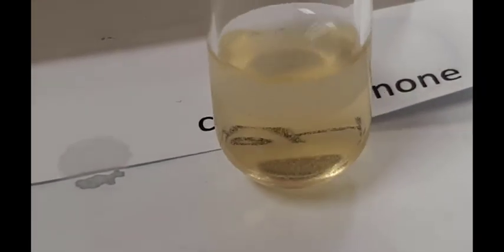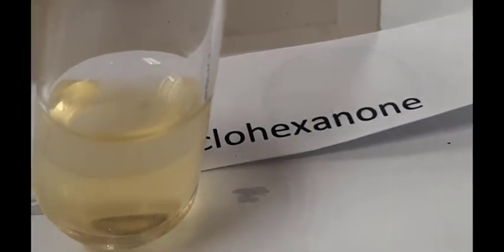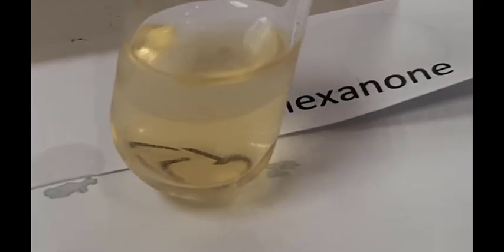Now, cyclohexanone might appear to have a precipitate, but let's go ahead and look at that from the bottom. You'll notice, if we look very closely, that there aren't really any crystals. Oops, let's see if we can get the camera focused. There we go. All there are liquid droplets that are mixed in with the solution. So there's no precipitate with the cyclohexanone.